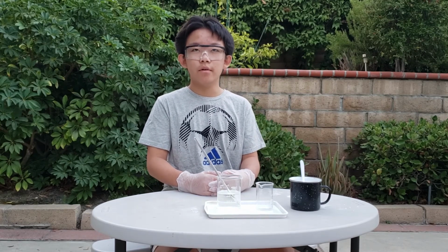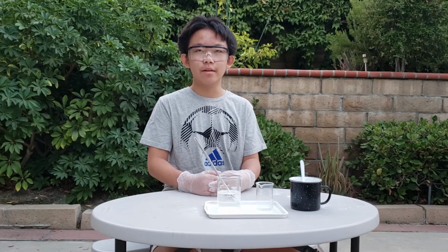How did you like the reaction? The reaction, as I said in the explanation, caused the common ion effect to happen. This created sodium chloride precipitate, and it looks a lot like snow, isn't it? You can always swirl it and then it will fall right back, just like a real one.